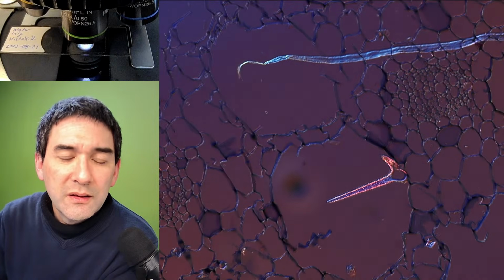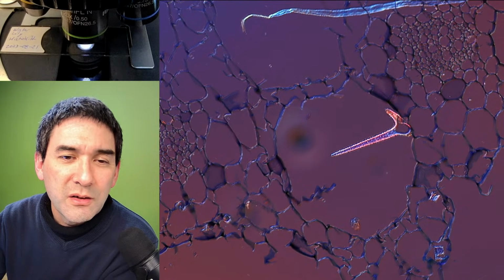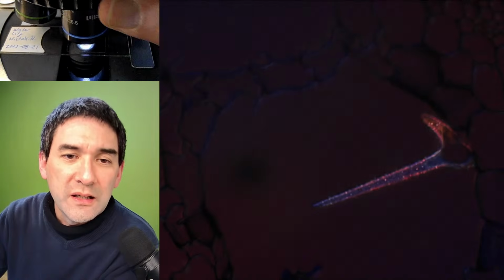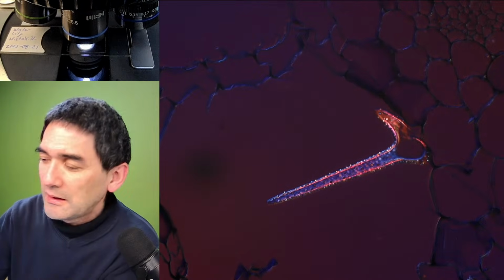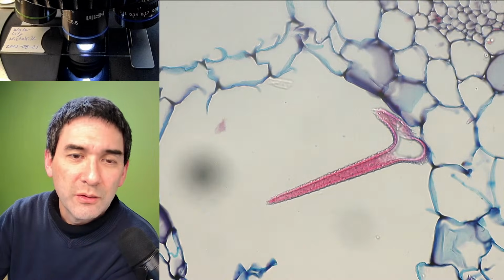Okay, look at this. Do you see this spike thing here? These seem to be calcium oxalate crystals inside the water lily. Very typical. And look, because I'm using polarized light now, look how nicely they shine. Basically, without any polarization, this is how they look in bright field.